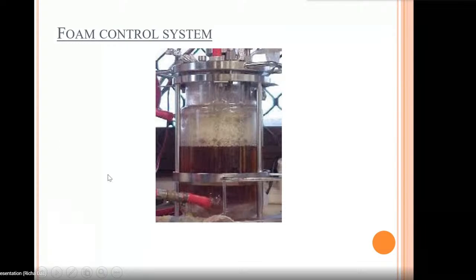So depending upon how much foam is formed by the product, we are going to adjust the headspace volume and the working volume. For example, if I am manufacturing curd, then my working volume will be 70% and my headspace volume will be 30%. But let's suppose I am making alcoholic beverages, then my working volume should be 30% and my headspace volume should be 70%.